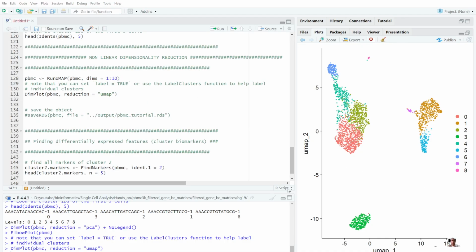We'll be proceeding with our work, and we will try to find the differentially expressed features, right? The features that are differentially expressed will be serving as our biomarkers. So the biomarkers are the transcriptomes, or the gene expression levels. And with the help of that, we'll be clustering.